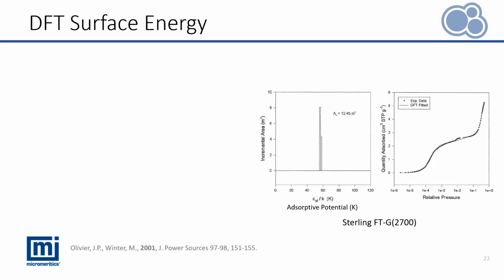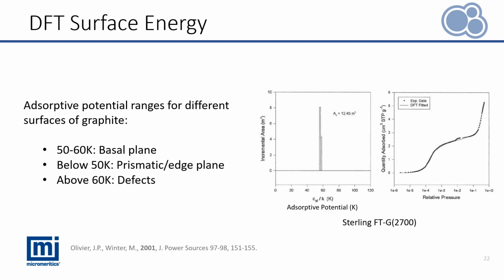The DFT surface energy method can be really interesting and valuable in the context of characterizing graphite and graphene materials, because in 2001, Olivier and Winter associated these different ranges of adsorptive potential to different planes in a graphitized surface.